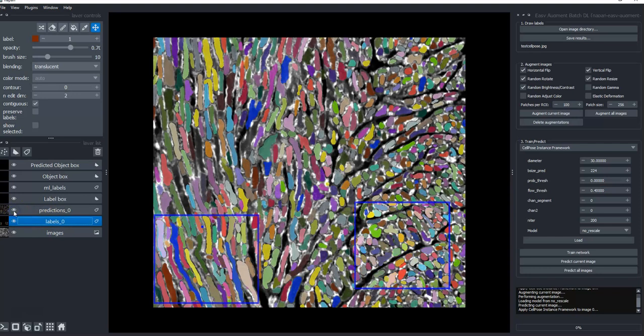And here's our new prediction. So yeah, we're headed in the right direction. This isn't obviously perfect. One of the main reasons is because when I draw labels for problems like these, I'm really sloppy, right? Because I'm using these example images really for partially self-serving purposes, just to test my plugin to make sure the wiring is all right.